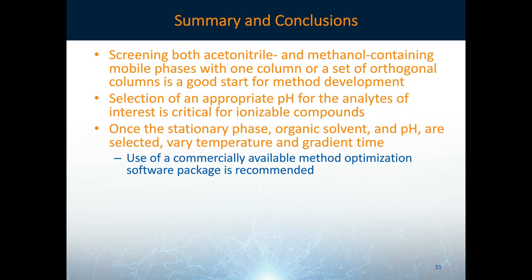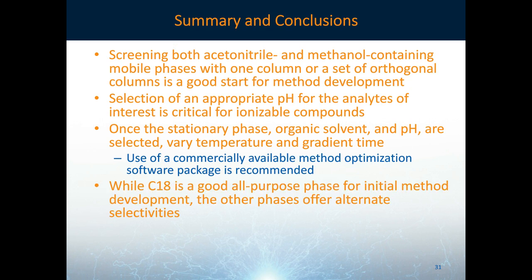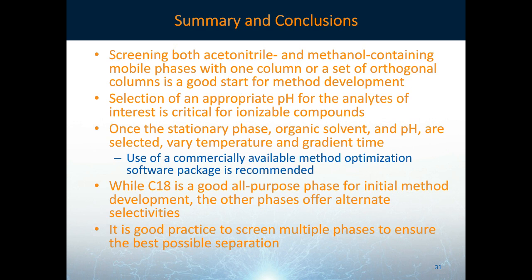While C18 is a good all-purpose phase for initial method development, the other phases offer alternate selectivities. And finally, it's good practice to screen multiple phases to ensure the best possible separation.